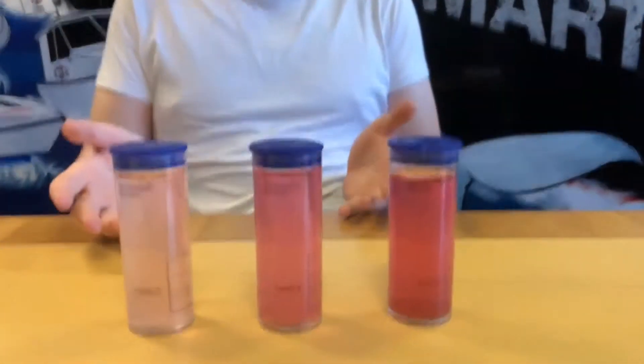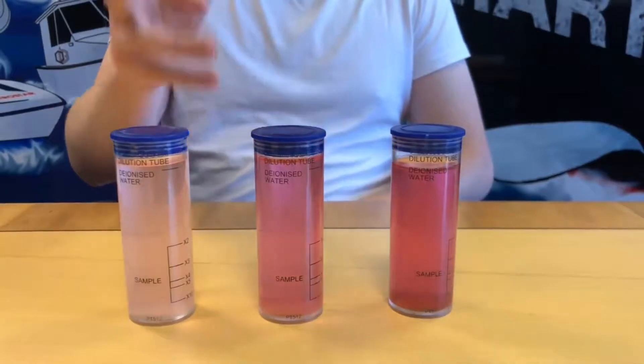So now we're back in the office, it's time to actually review the results that we took earlier. You can see we've had quite a little bit of change. This was the one that we put three in, two in, one in.